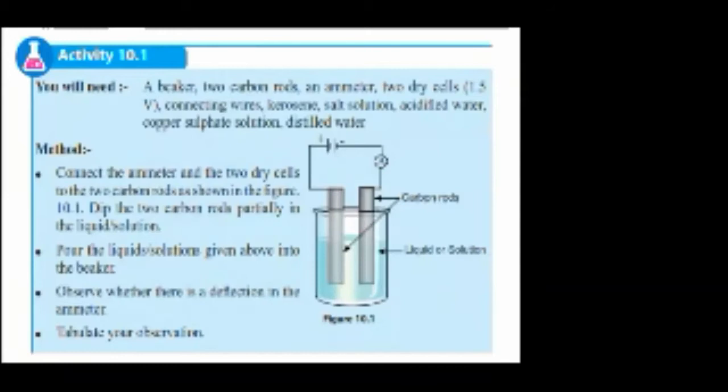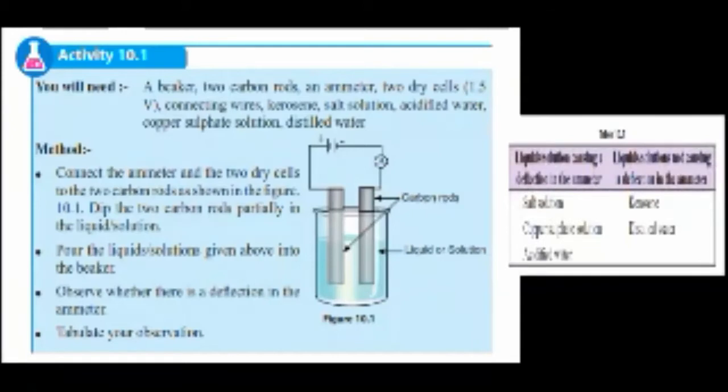Now, these are the observations of this activity. Liquids and solutions causing a deflection in the ammeter: salt solution, copper sulfate solution, acidified water. Liquids and solutions not causing a deflection in the ammeter: kerosene and distilled water.